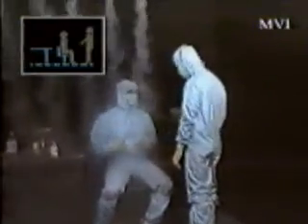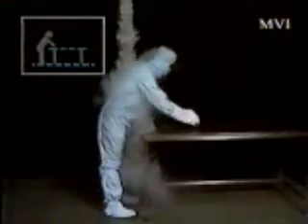So far, we've illustrated only the room and wall areas. When people are introduced, it's their presence and the laminar boundary layer and turbulence caused by their movements which will transport contaminants. When people are added to the variables, not only work area planning comes into play, but the work practices of the person are equally relevant. It is necessary to stand or sit adjacent to a work area, but the speed and type of movements made are critical to the control of turbulence and thus contamination. The speed of movement is of great significance.